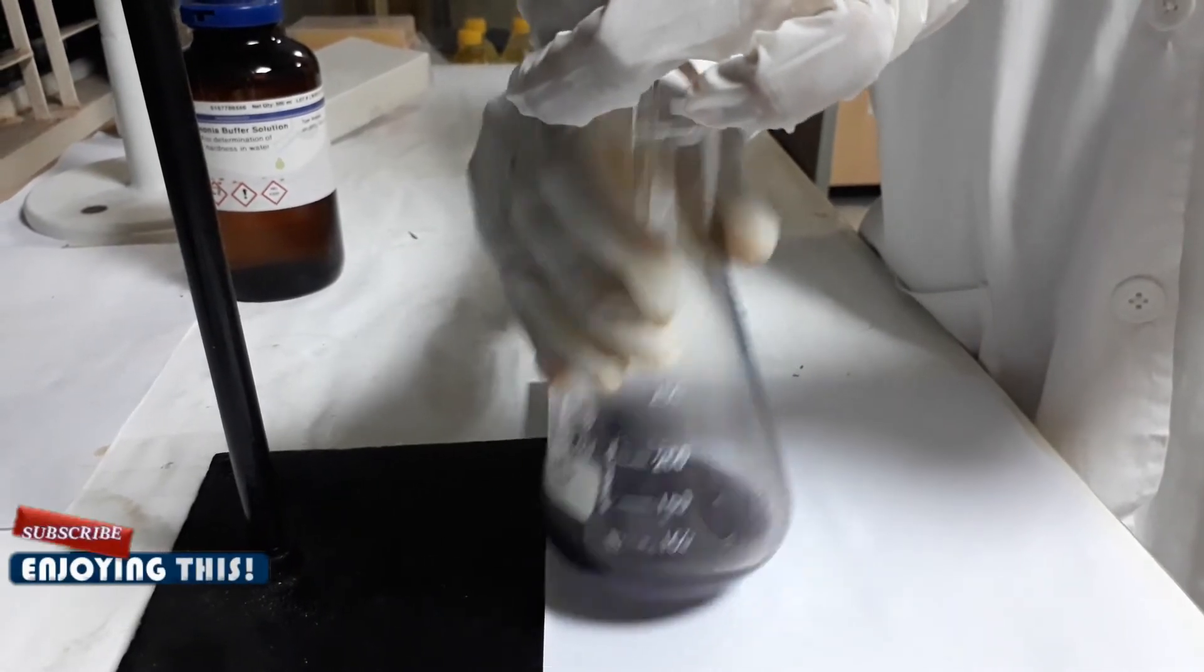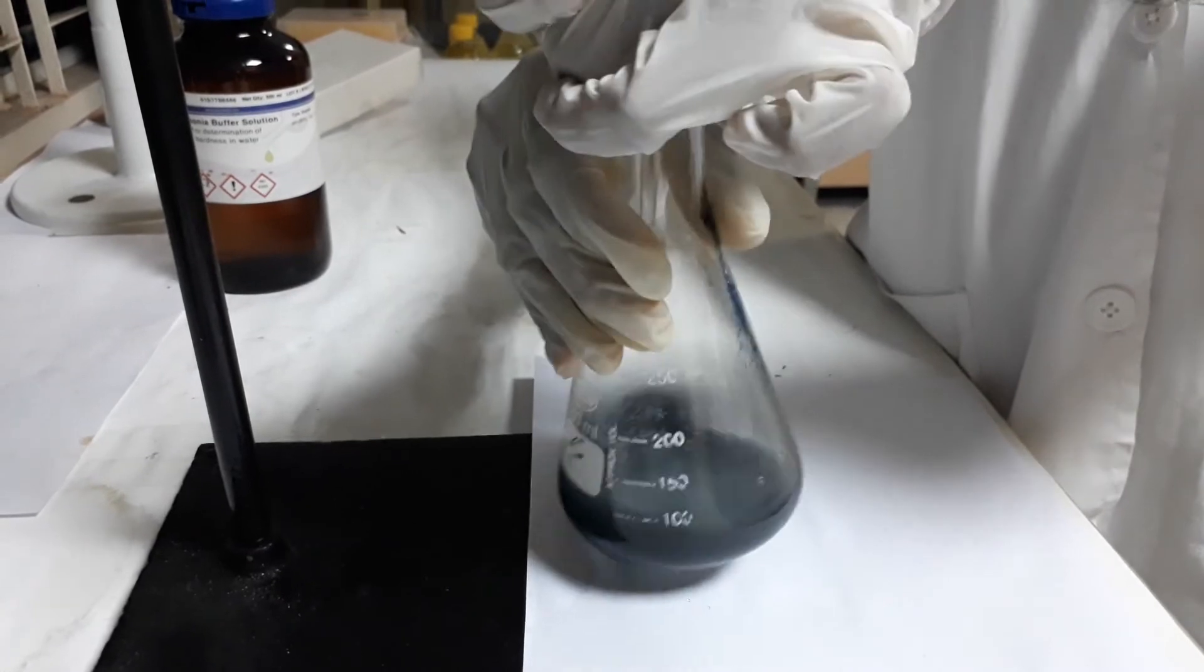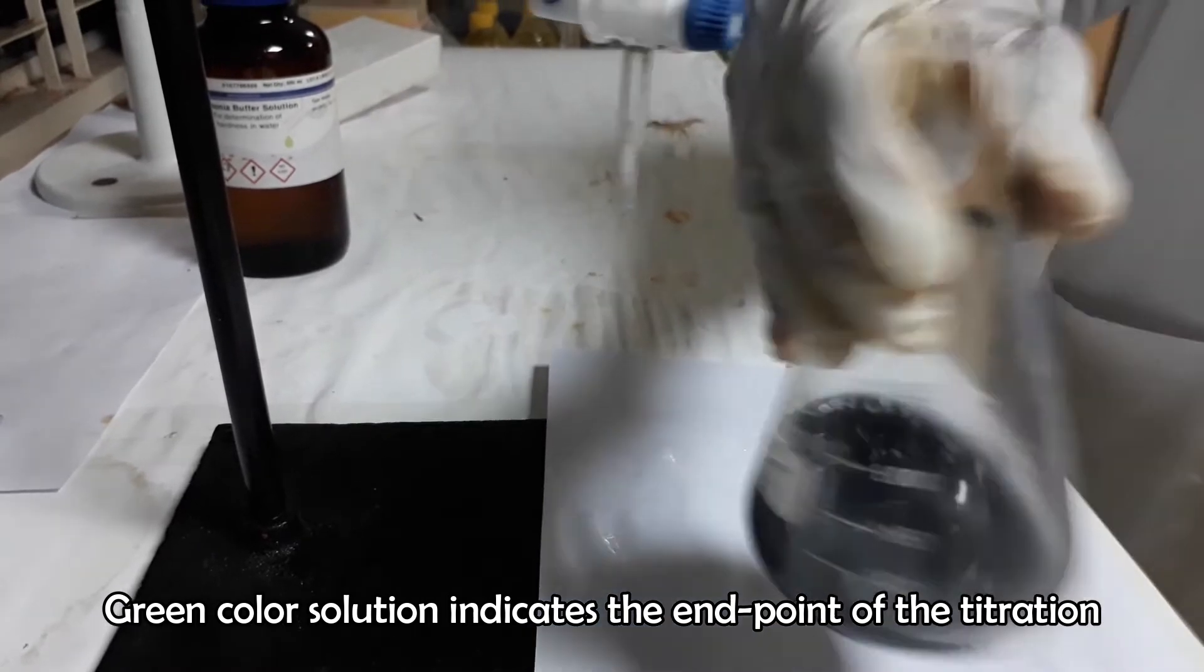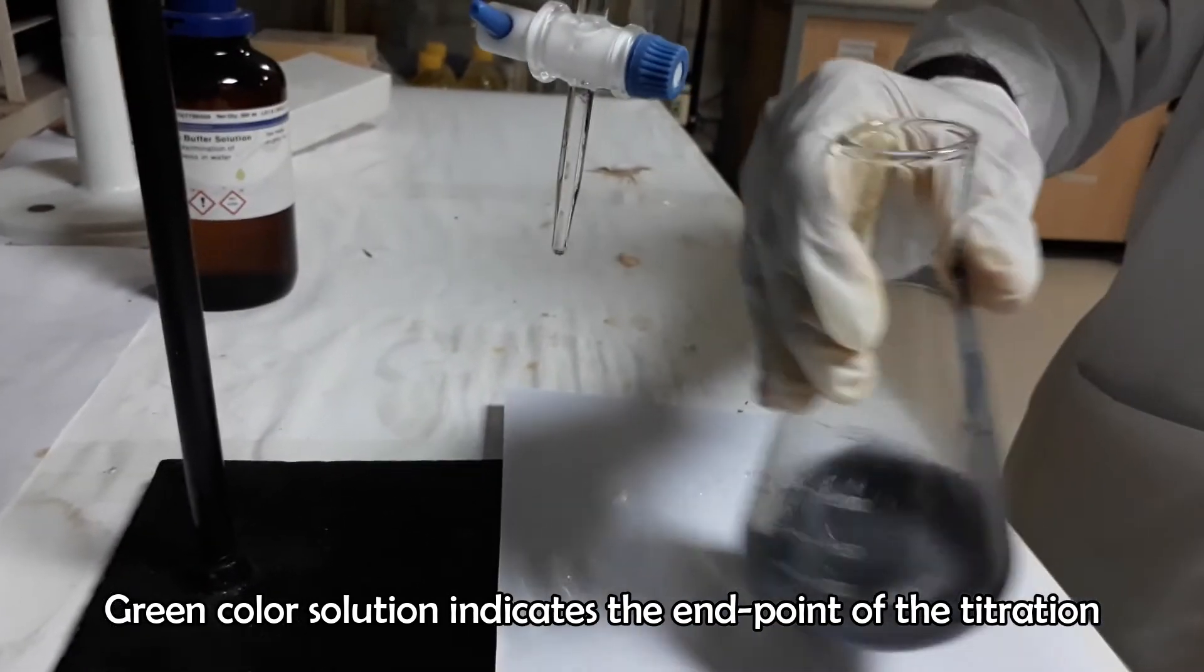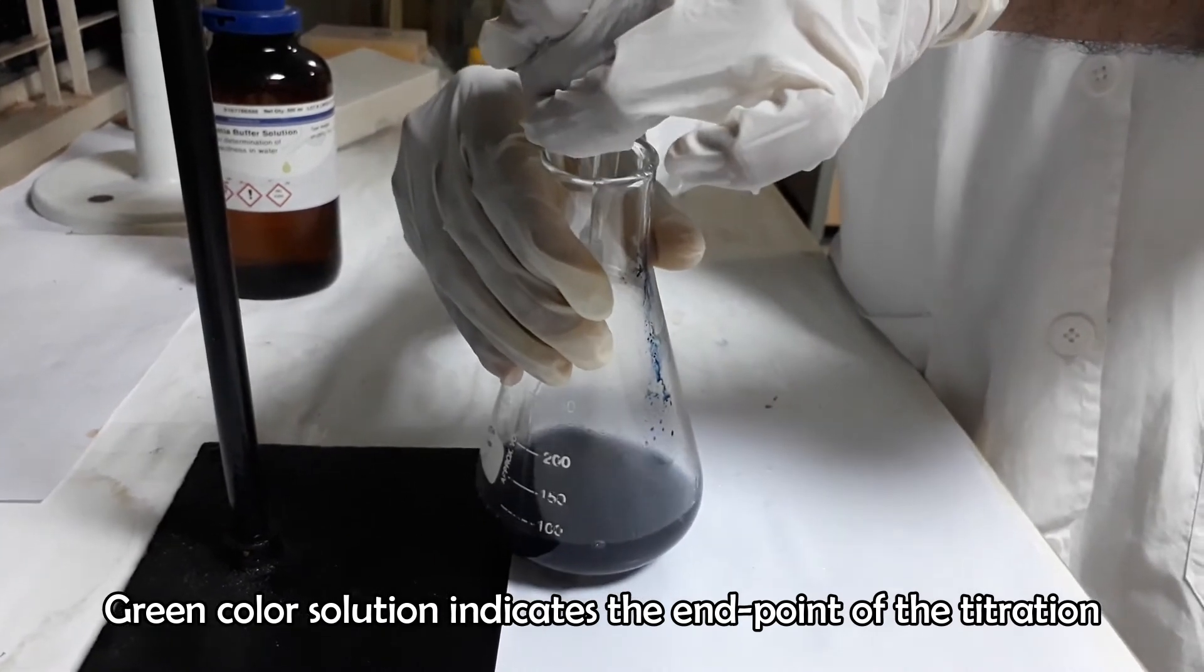Titration should be carried out with vigorous agitation of the flask to get accurate results. Stop the titration when the solution color changes to green. Shake the flask vigorously to ensure the permanent green color solution. Resume titration again if the violet or purple color comes back.